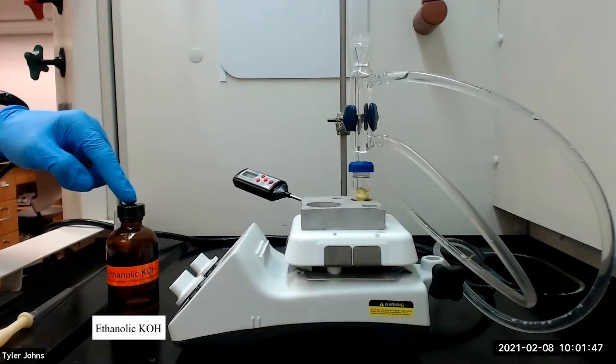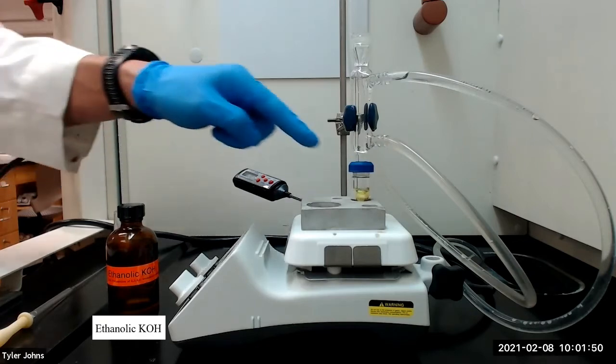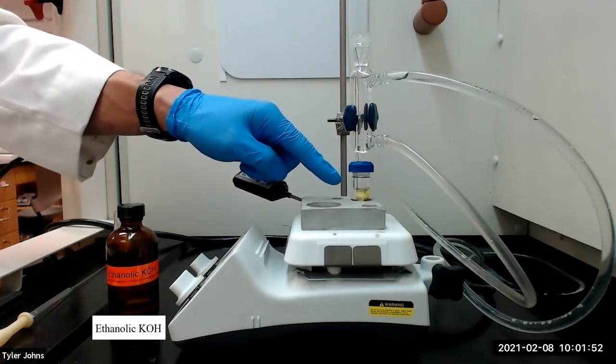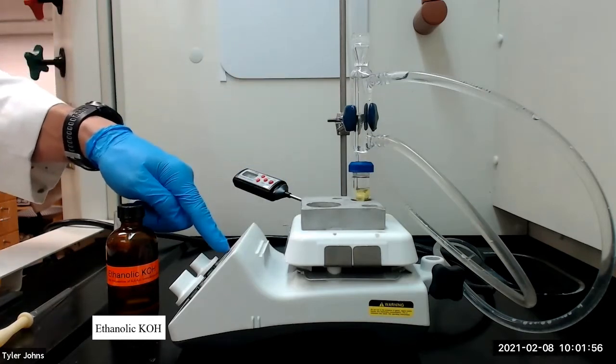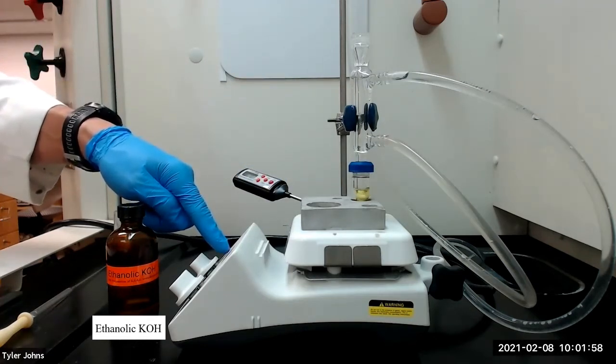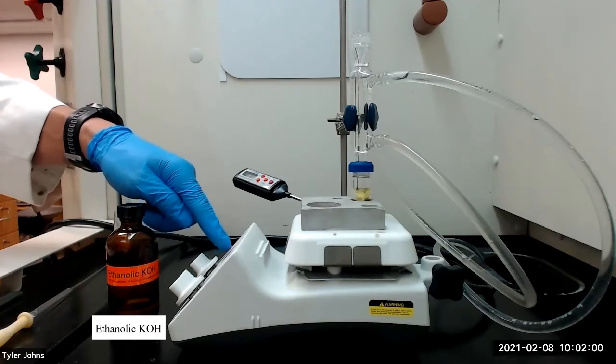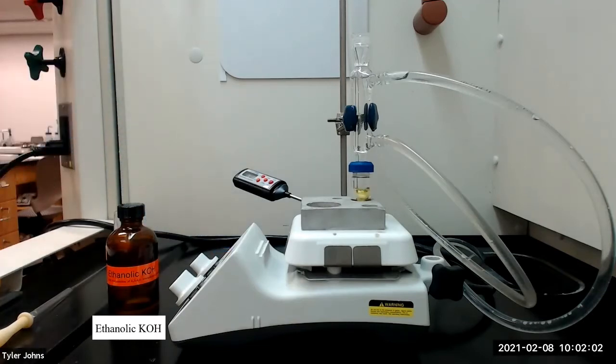Once the ethanolic potassium hydroxide solution is added to the mixture, the mixture will immediately turn a deep purple. We will then need to raise the temperature of the hot plate until the mixture is at a gentle boil, and we will heat the mixture while stirring at a gentle boil for 15 minutes.